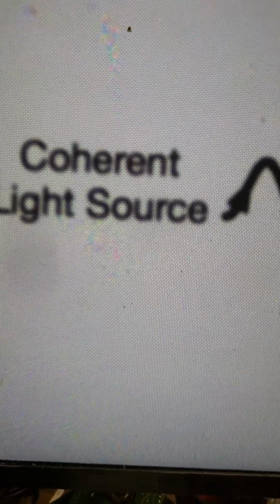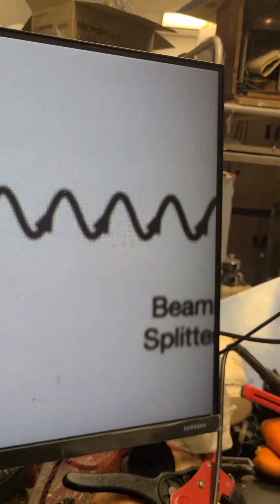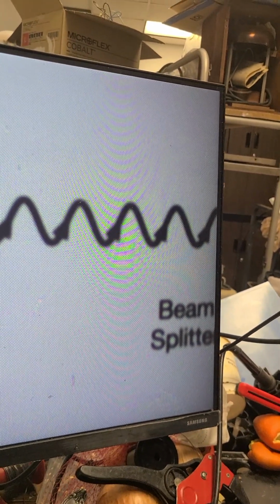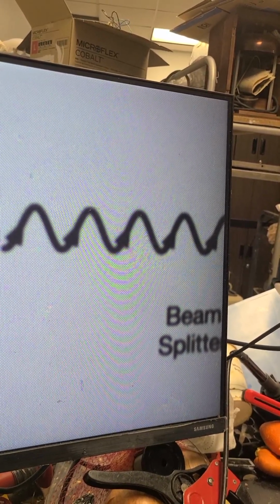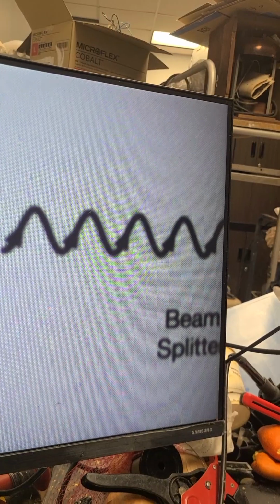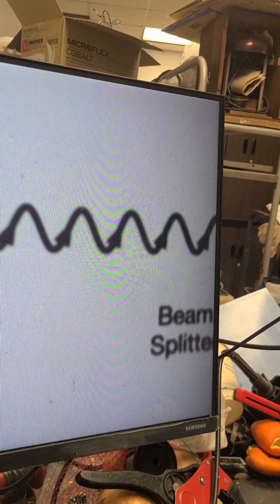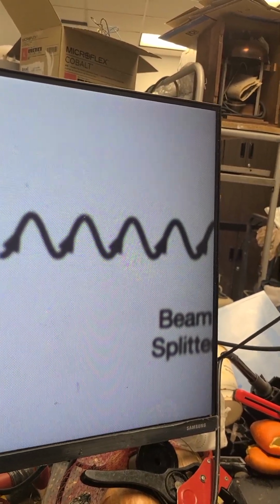if we think about, let's say, a 64 megapixel camera that has a 1 inch by 1 inch detector, that would split the surface into 8,000 steps horizontally by 8,000 steps vertically. So 8,000 times 8,000 creates 64 million pixels.